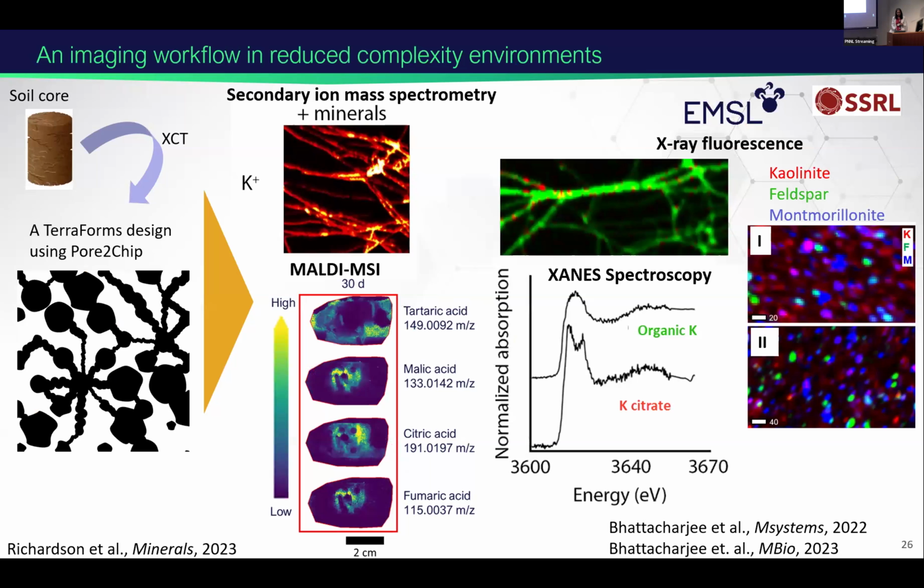Okay, and so just to wrap up, I think right now I'm going to just show you this slide here where we have done a lot of integration using these reduced complexity platforms. Tamas showed this slide as well. So using this new capability Pore2Chip, we can actually do one more connection there with the soil pore connectivity, and then connect them to these different chemical imaging techniques, which shows a really nice story of integration.